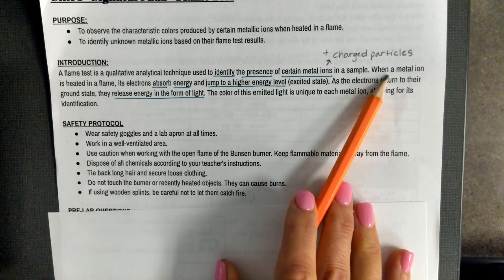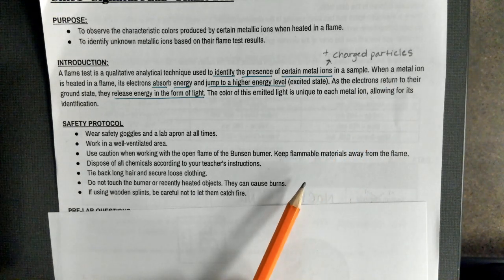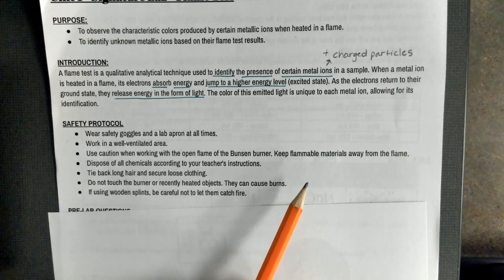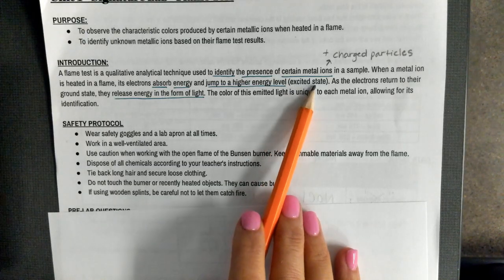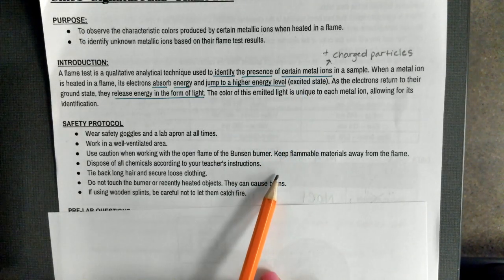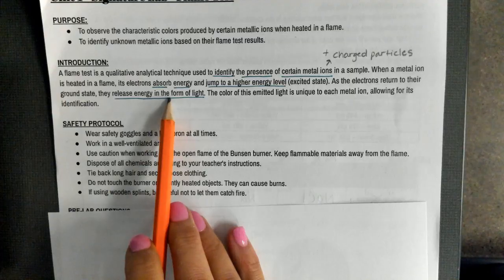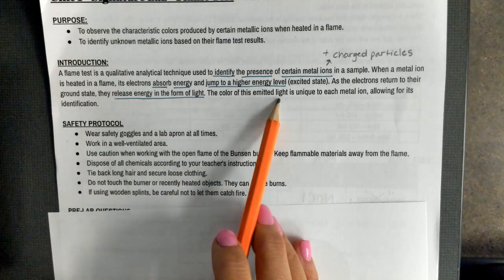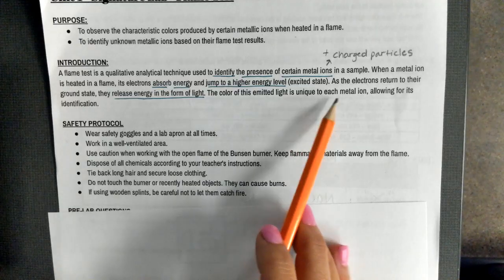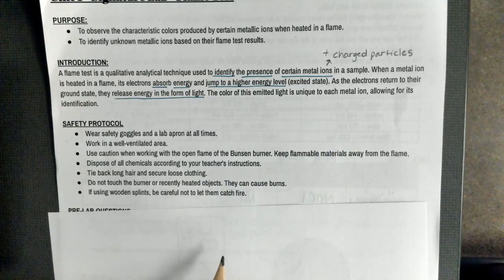So when our metal ion is heated in a flame, its electrons absorb energy and jump to a higher energy level. That's the same thing as an excited state. As the electrons return to their ground state, they release energy in the form of light. The color of this emitted light is unique to each metal ion, allowing for its identification.